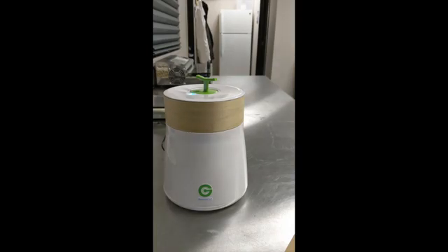Overall, we're really happy with the Gemisert. They're constantly working on the firmware and updating it, and it has been improving since we first purchased it. It is a great tool in our arsenal for both flower production and breeding.